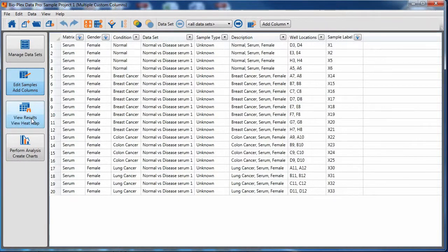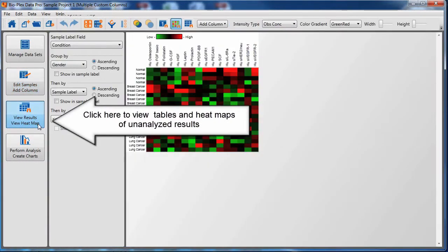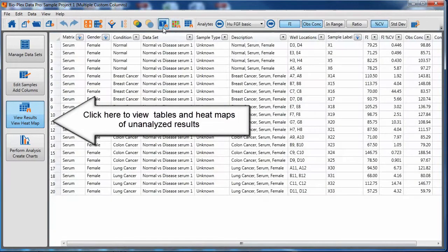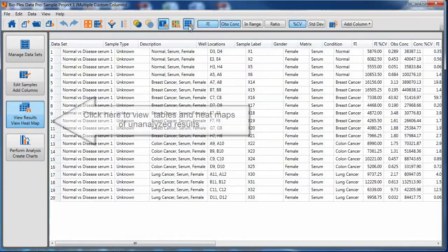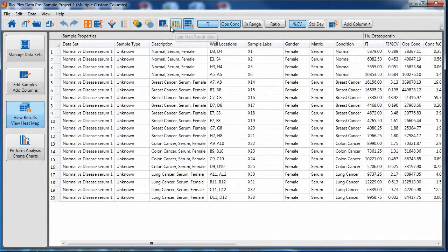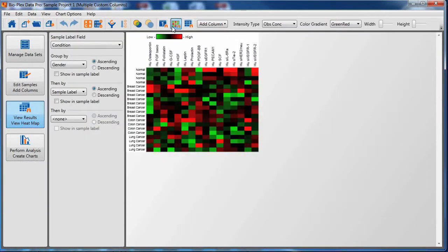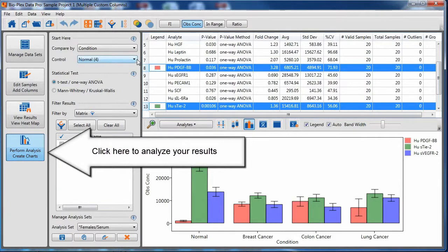Click on the third button to view tables and heat maps of unanalyzed results. Think of this as your results listed by sample with no grouping information used for analysis. Click on the last screen to analyze your results, taking into account biological replicates.